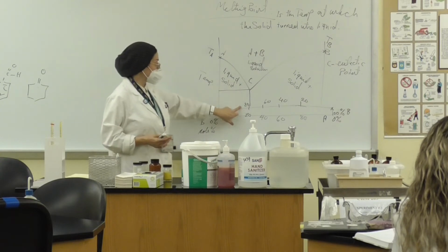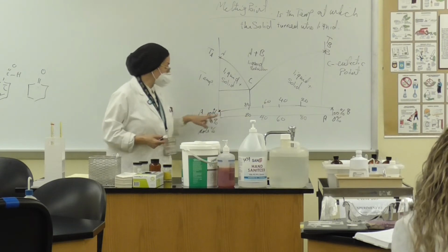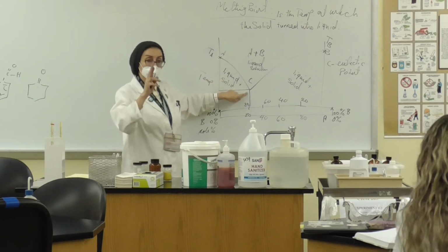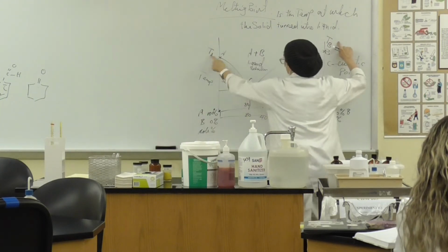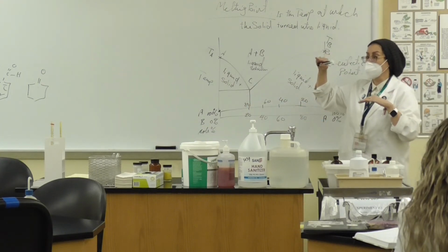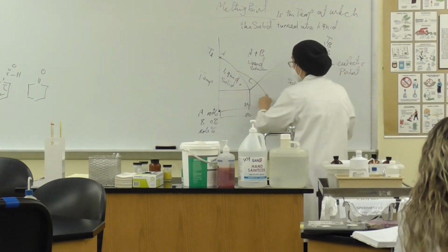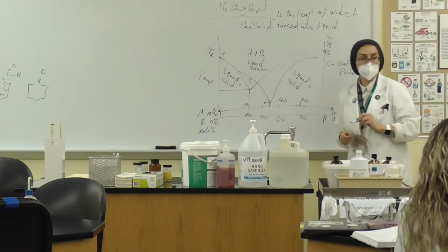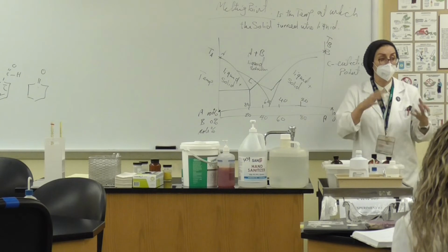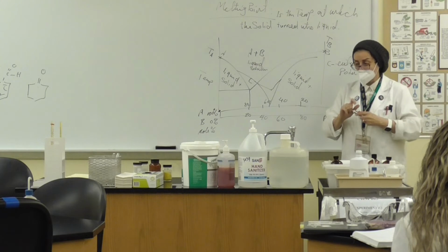When you're going to have, let's say, 80% of A chemical and 20% of the B chemical, you're going to see the melting point of both of them, of the B and A, is going to be very low. It's going to be lower than the usual pure chemicals, okay? If we have 50-50, we're going to have it over here, something like that, okay? But it is going to be less than the normal when it is pure.